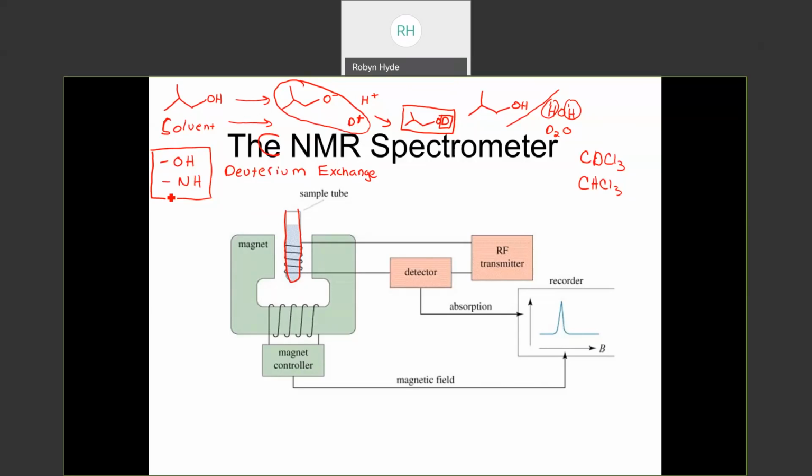Then to get our sample into the magnet, we turn off the air, and our sample just slides down into the middle of the magnet. That's that part. Pretty straightforward, but there's a little bit of airflow that keeps going around the tube. It's directional, so how the air goes into the tube, it feeds in a certain direction so that our sample will also spin.